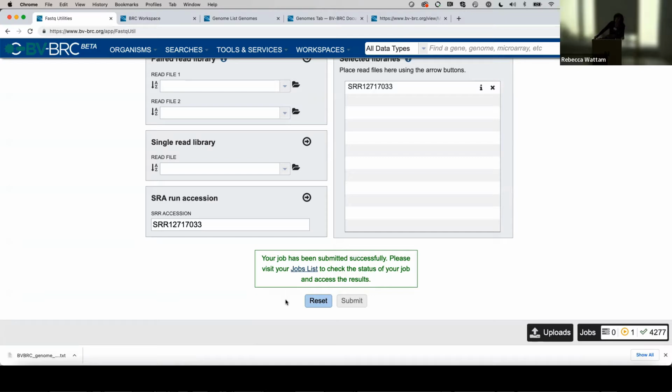So for something like assembly, I will sometimes get an email message saying, I submitted my assembly job an hour ago and it still hasn't finished. What's wrong with your system? You have to give it like 24 hours when you're dealing with reads to let it start, because it all depends. Our most popular services right now are assembly and annotation. Annotation, lightning fast. Assembly, it can take some time.